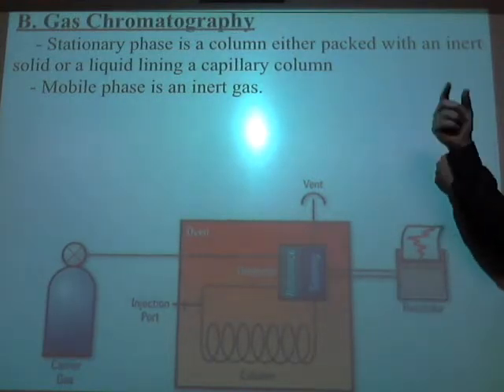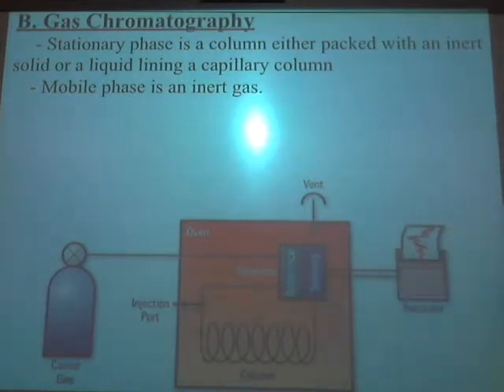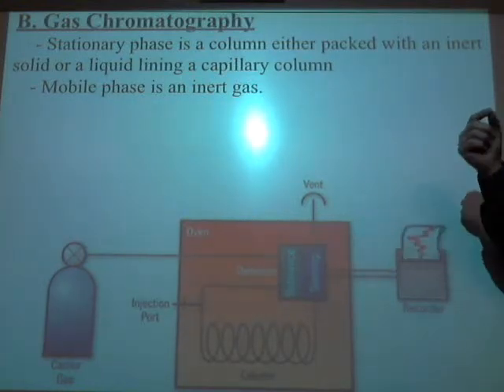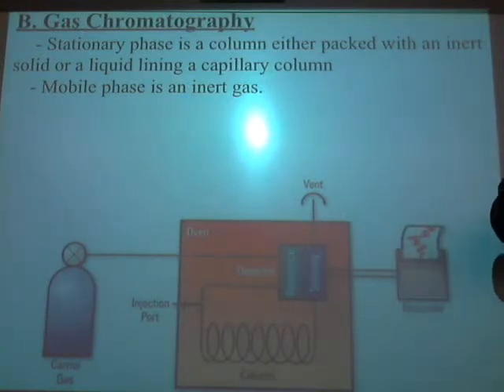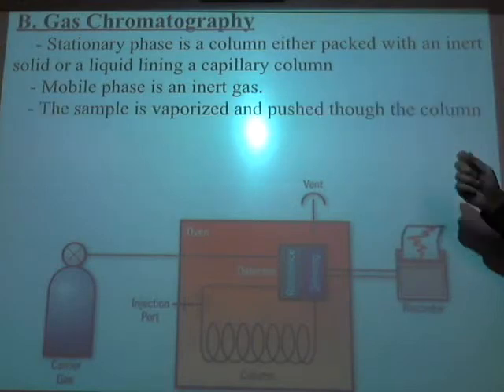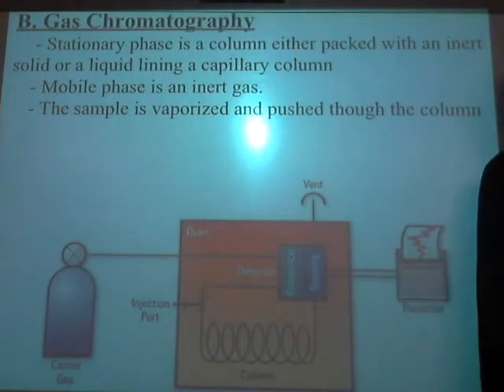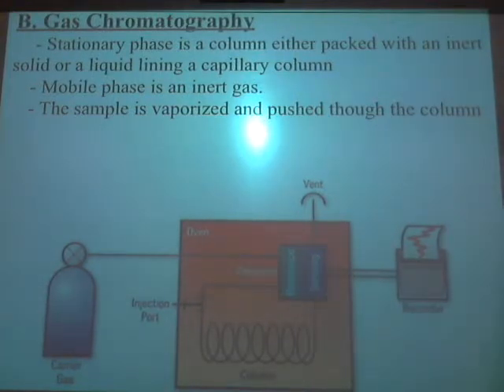All right. So the mobile phase is usually helium, and that tank, that cylinder you saw to the side. Somebody in the air class said they had one of these machines in that room. Remember the chart he showed you, with peaks and valleys on the chart? Same thing. They had a gas chromatogram. The sample's vaporized when you push it in there with a syringe, and then it's pushed through the column with the gas, usually, like I said, helium.